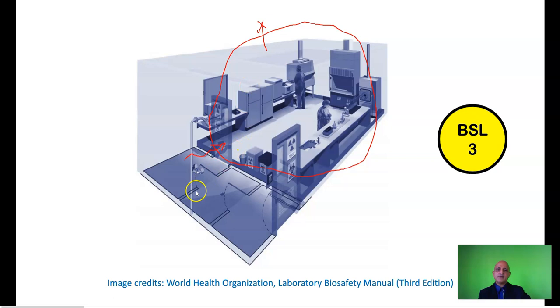airflow. Now, the air enters through this laboratory and it's discharged via the hard duct, and it also may be discharged via other vents, and it is discharged into the environment via the HEPA filters, which allow or permit the flow of the air but not the flow of the pathogens into the environment, and this accords a level of protection of the environment.